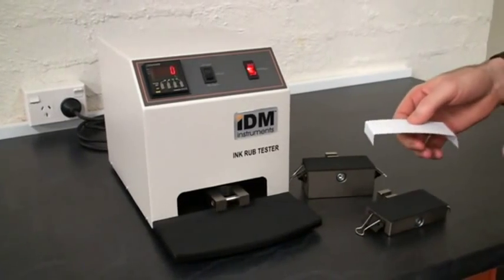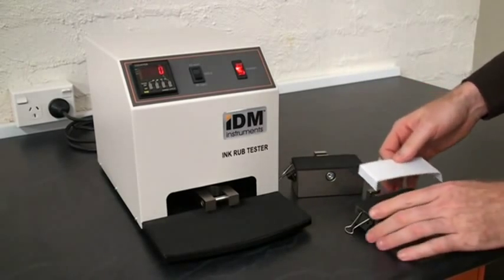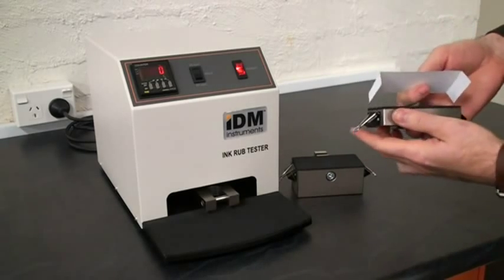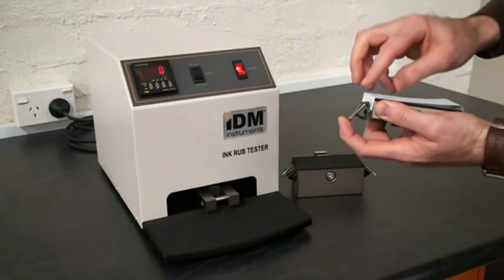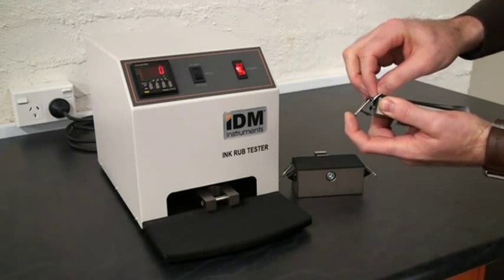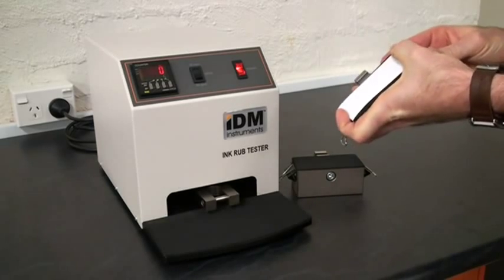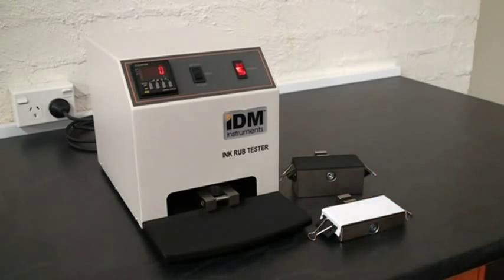We'll be placing a white sheet of paper onto the 2 pound weight, and in this instance it's been pre-creased on our creasing board. Open the clamp and close it. Likewise on the opposite end. And now that's ready to go on the sample.